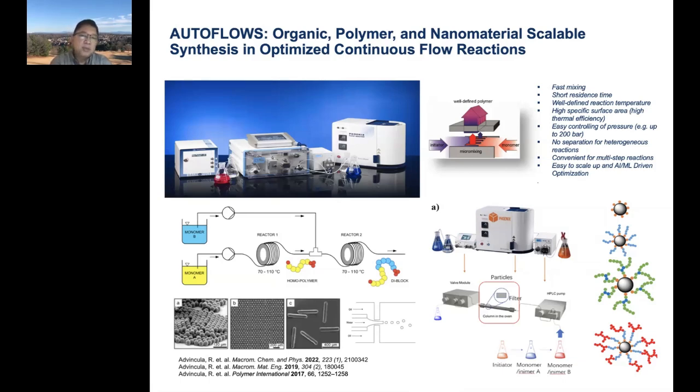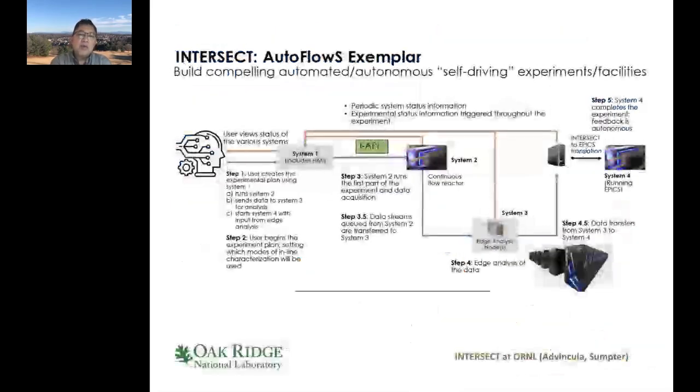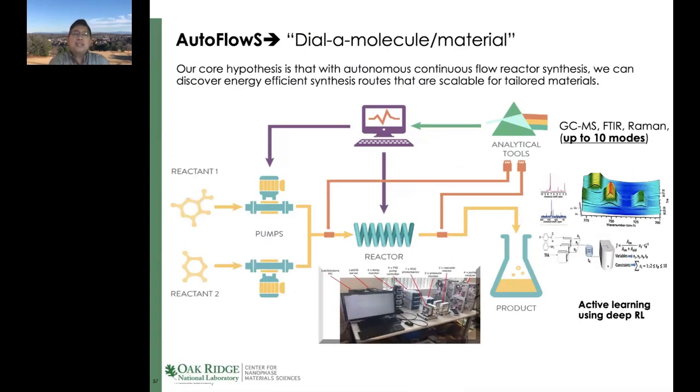And this can be used for synthesizing polymers, grafting polymers, or even making nanoparticles. So, in the future, is it possible for us to use machine learning directed synthesis through the use of laboratory tools that include monitoring or sensing, or even having an edge server that collects both the data and controls the experimental station, and then finally access to a high computing facility that allows us to do real-time algorithm development. So this laboratory of the future will mean that we basically have a computer that controls the dosing of the reactants, a tube reactor or a coil reactor that can be operated as a plug flow or a packed bed column.